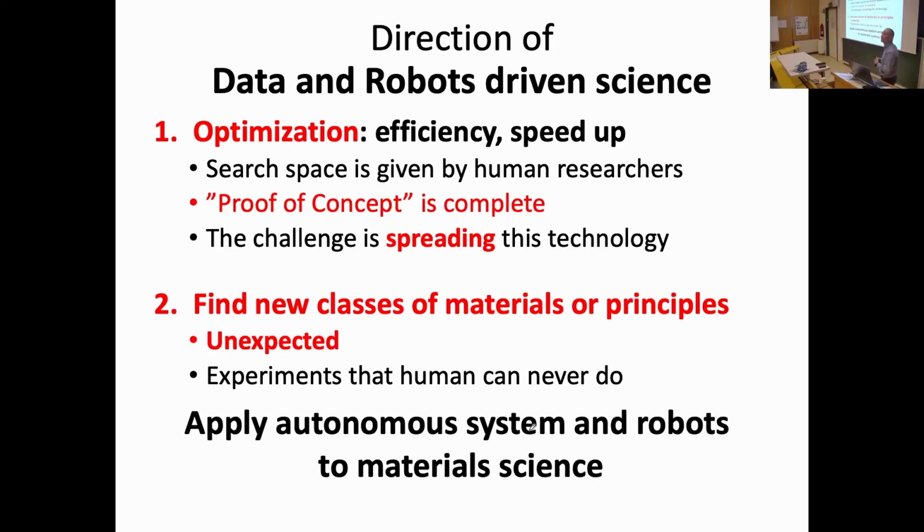That technique is still developing, so we are focusing on this stage now, and many techniques are coming out to really go toward something unexpected. That is the current situation. So if we start with autonomous automation, start by choosing the topic from optimization. If you start from the other one, sometimes it's not efficient or useful. So at this stage, optimization is the latest topic.